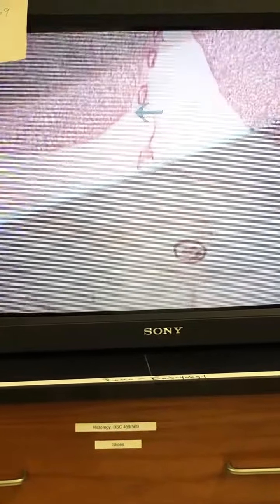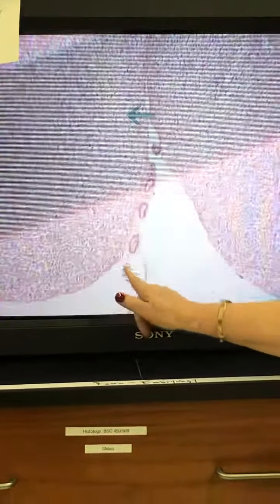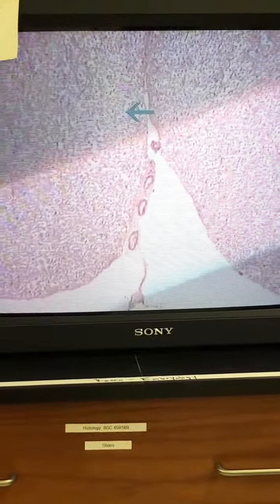line. And see, inside it's got blood vessels. So that would be the subarachnoid space. Okay, and then if you're up here, you see this little line coming off of this, like right here, that would be the pia mater. Okay. So then what else were you supposed to know?